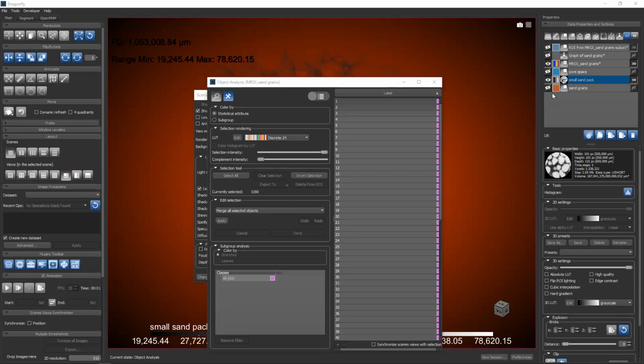To a binary image. I can't show it in 30 seconds, so put that as a seminar topic request so I can dedicate some time to it.